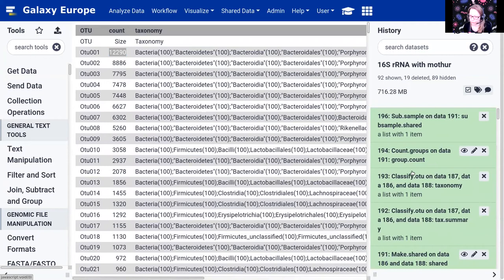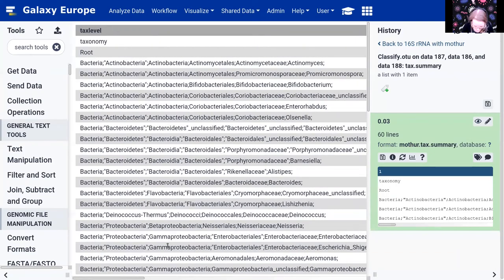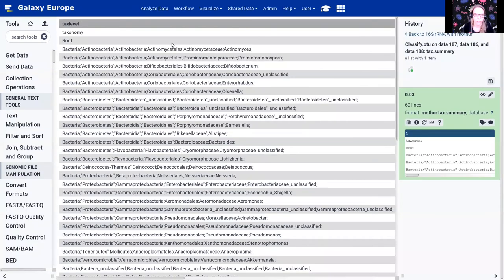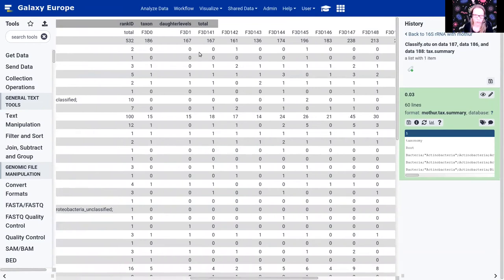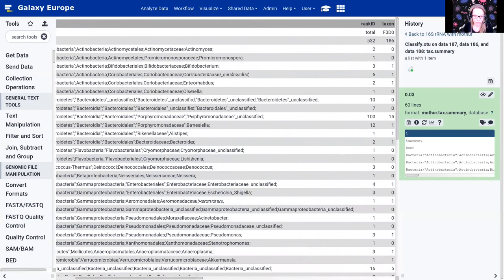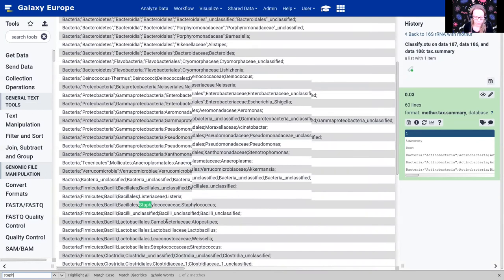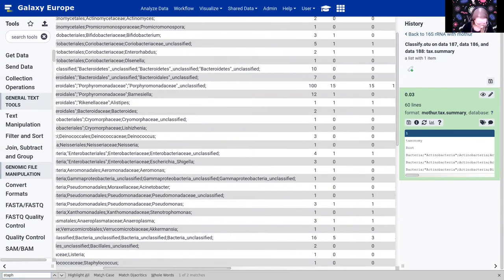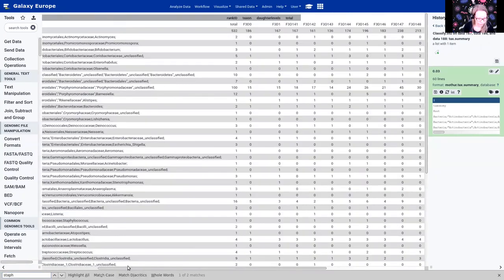The other output is the summary file, which shows for each OTU whether it was present in each sample — you can see the number of reads per OTU per sample. For example, the tutorial asks: can you find which samples contain Staphylococcus? You would search for Staphylococcus in this file, find the corresponding line, and check which samples have a non-zero count. Looking at that line, samples from day 141, 142, and 144 appear to contain Staphylococcus.